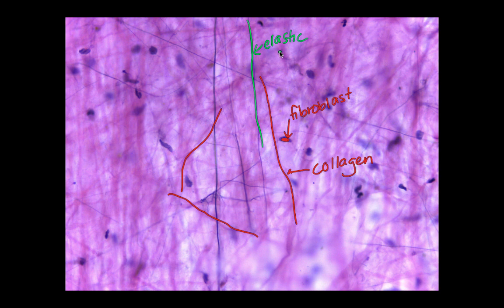Because areolar connective tissue is loose, that means it has more ground substance and less fibers. So although you see a lot of fibers in here, you're going to see a lot less than when you look at the dense connective tissues. All the spaces that you see in here, that's where the matrix or the ground substance is found. The matrix is composed of both the ground substance and the fibers. Areolar connective tissue will also have macrophages, mast cells, adipocytes, and other cell types.